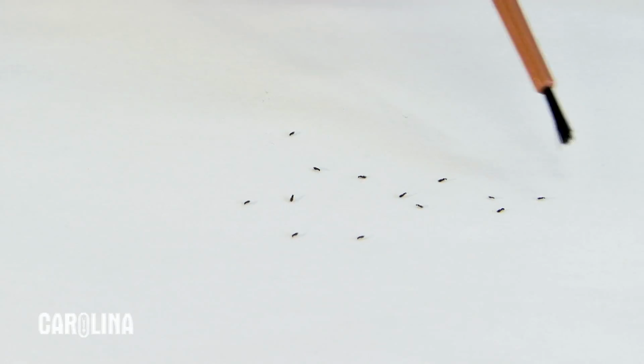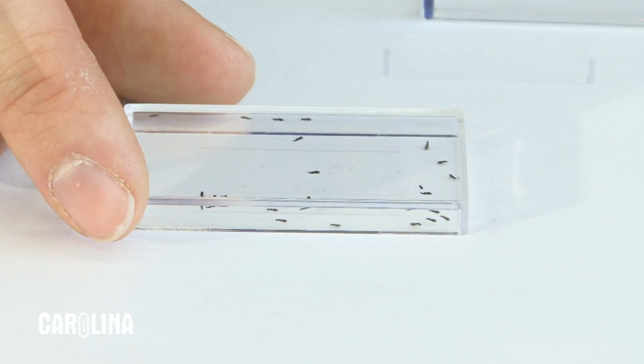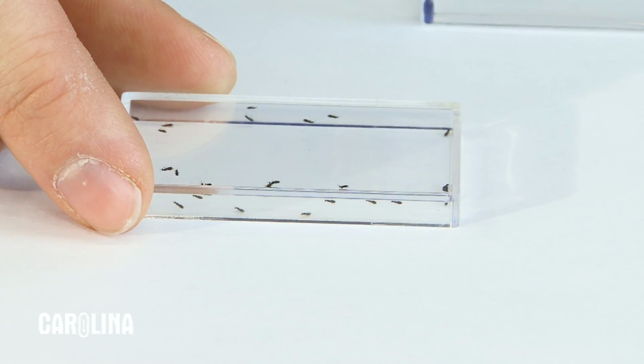WOWBugs are easily moved using a plastic bristled paintbrush or the nap from a pipe cleaner. Students can observe their movements from hopping, crawling, and playing possum. If some WOWBugs escape, simply place a lid over top of them, as they will climb up the inside of the lid. Once they are on the lid, remove the lid and place it on the container to corral them.